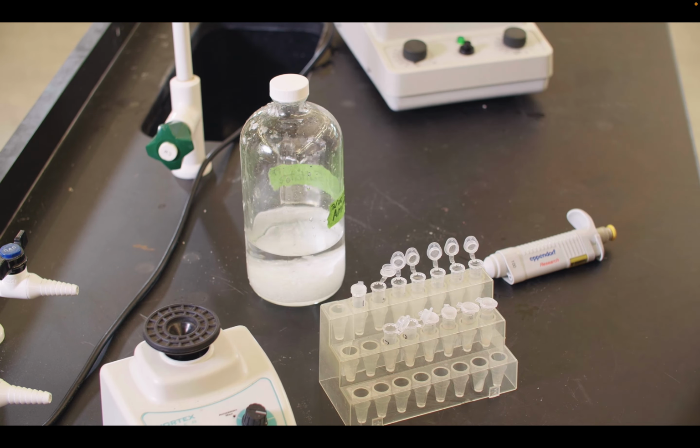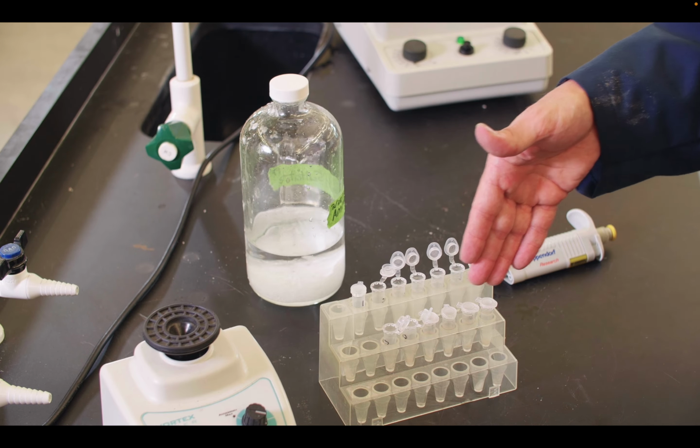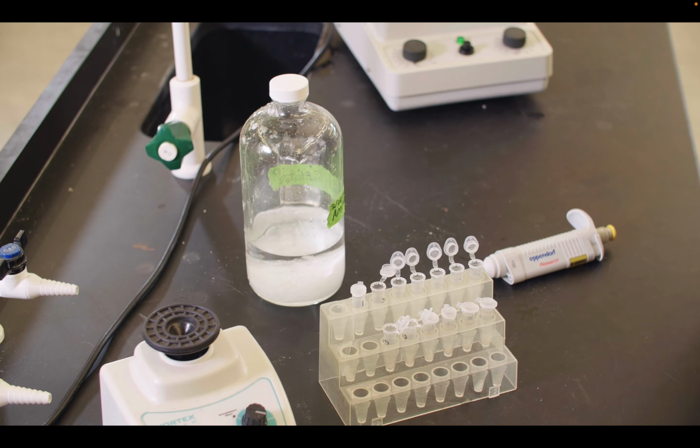And then for each one of the other ones, tubes 2 through 7, we've added 0.4 milliliters also of the fraction 2, containing some of our GOT. And then we've already aliquoted out the appropriate amount given in the developmental ammonium sulfate table that we're showing you, about how much ammonium sulfate we're going to add to each one of these tubes, and to basically get to see how much protein is precipitated in each case.